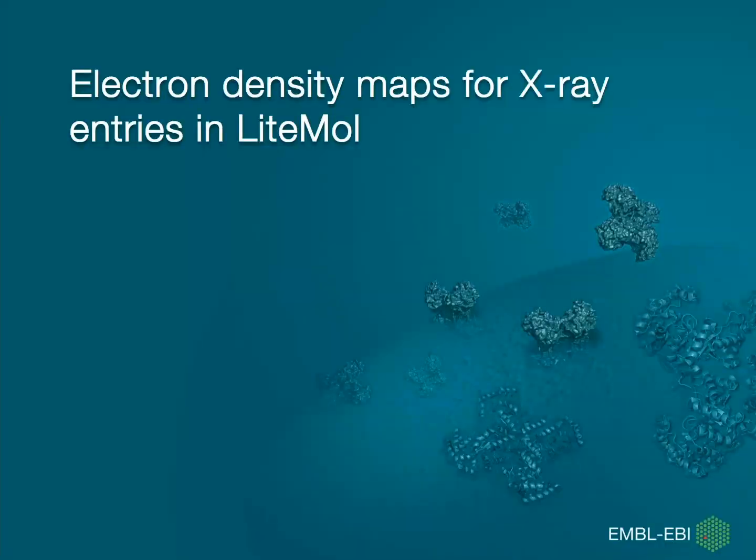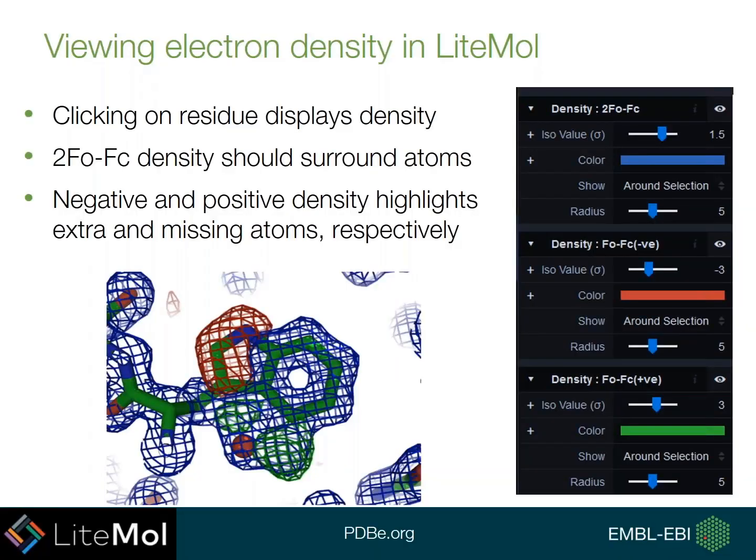One major benefit of LiteMol at the PDBe is the ability to view electron density maps for X-ray crystallography entries. This is thanks to EDS, which is now hosted at the PDBe. So if you open LiteMol for an X-ray crystallography entry, you can then click on a residue, and this will display the density around this region.